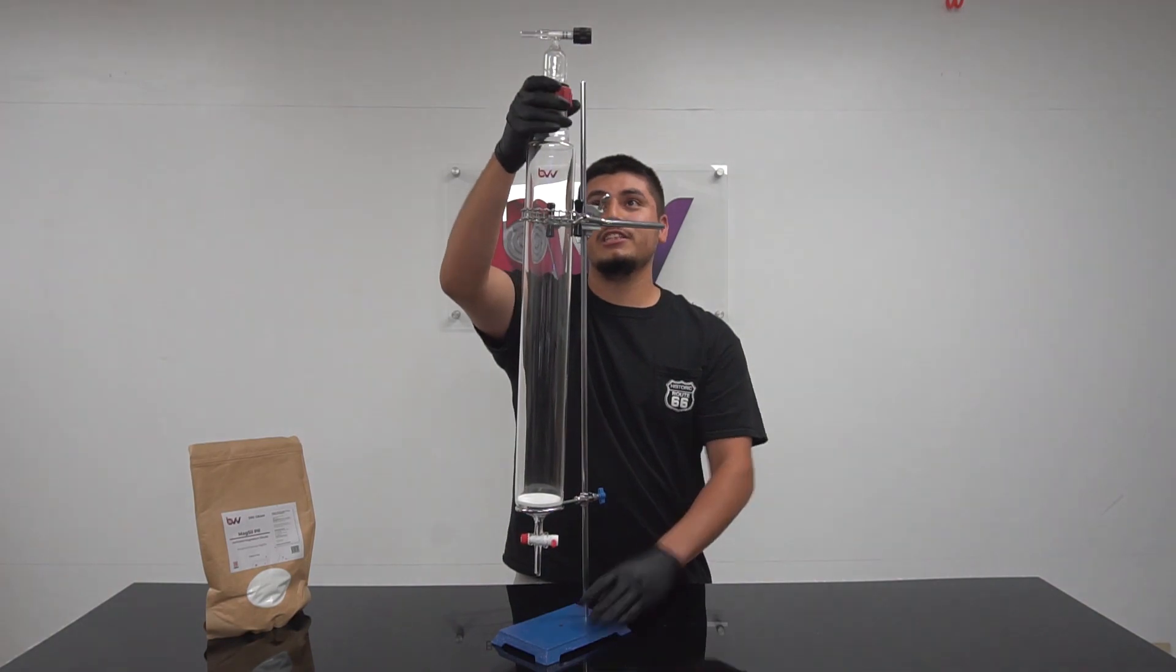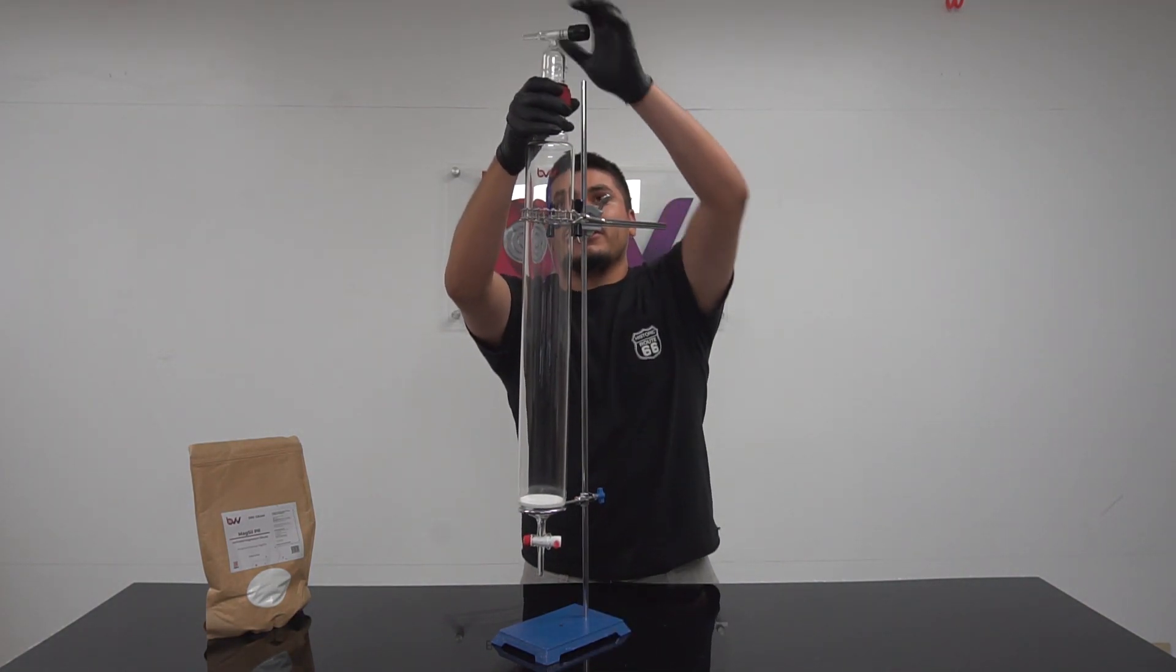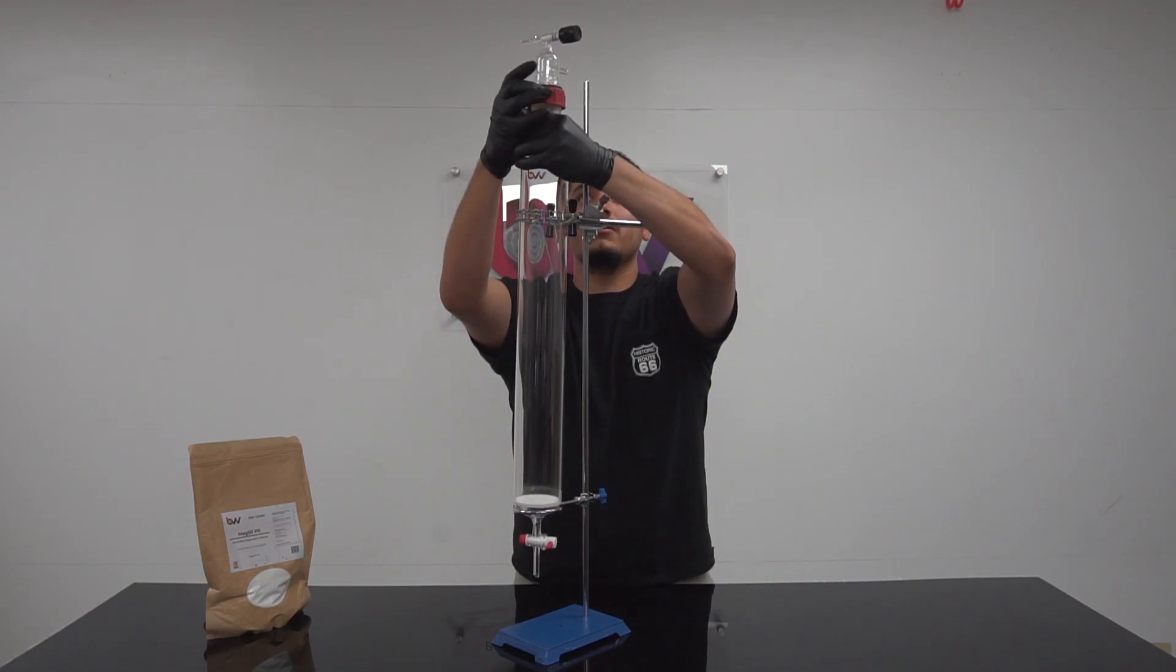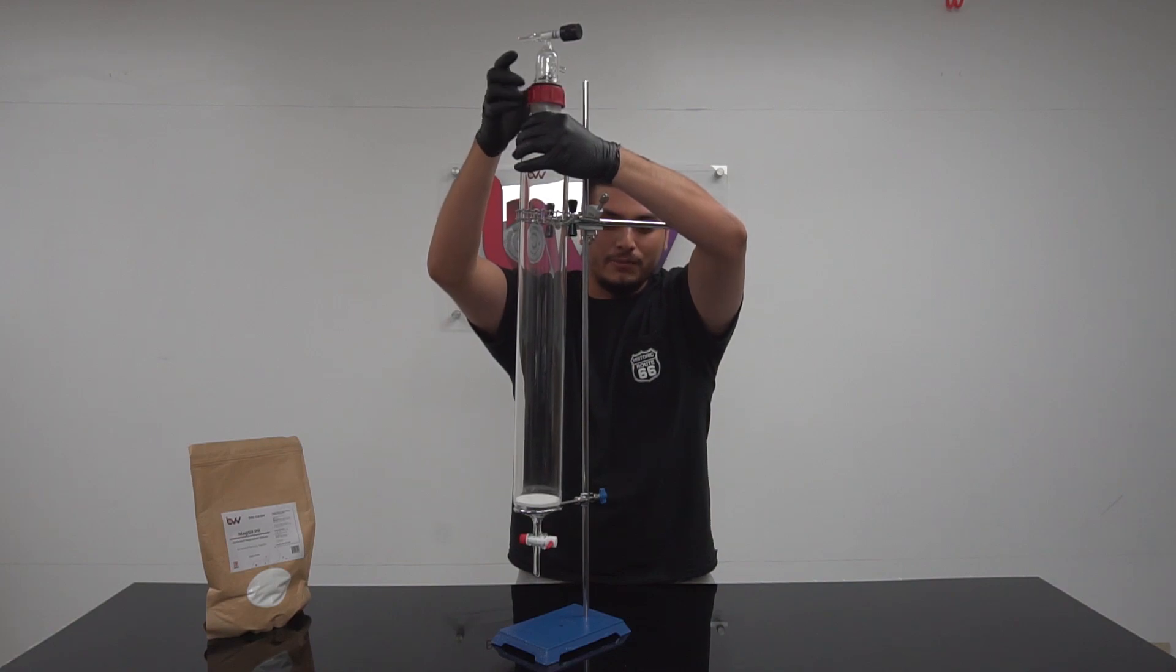This makes it really easy to pop it off. What it does is the top ring allows it to push off the top valve and slip right out. This is great for any standard joints.